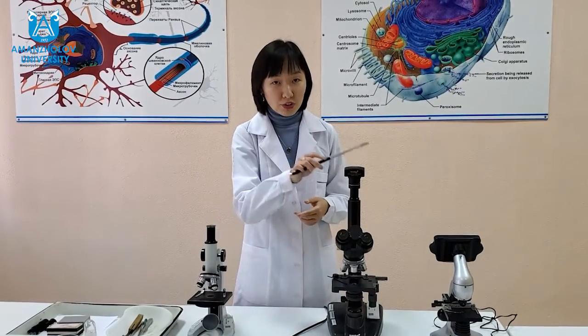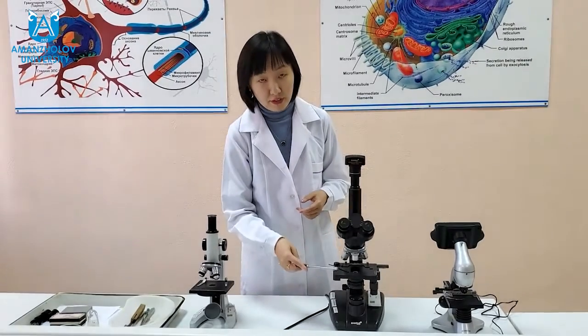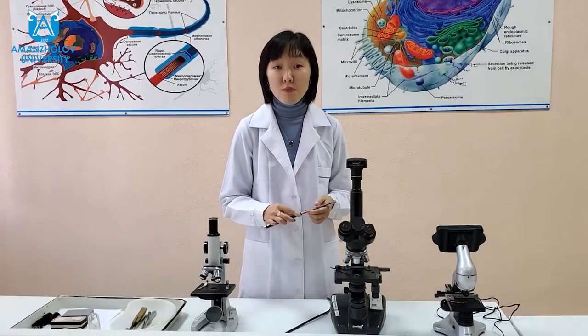The tube holder is a block on which the following are fixed. The first, a unit for changing objectives, having a revolving device for screwing in objectives. The second, focusing mechanisms for rough and fine adjustment of the microscope for sharpness. Third, a unit to attach interchangeable object stages. Fourth, a unit for attaching the condenser movement.